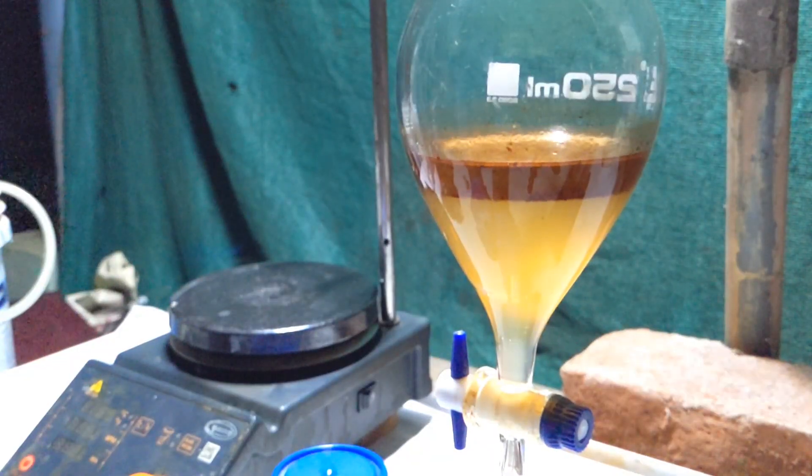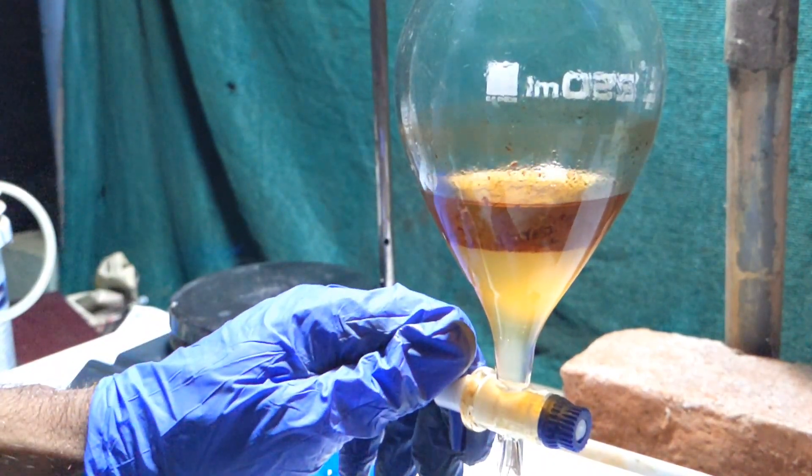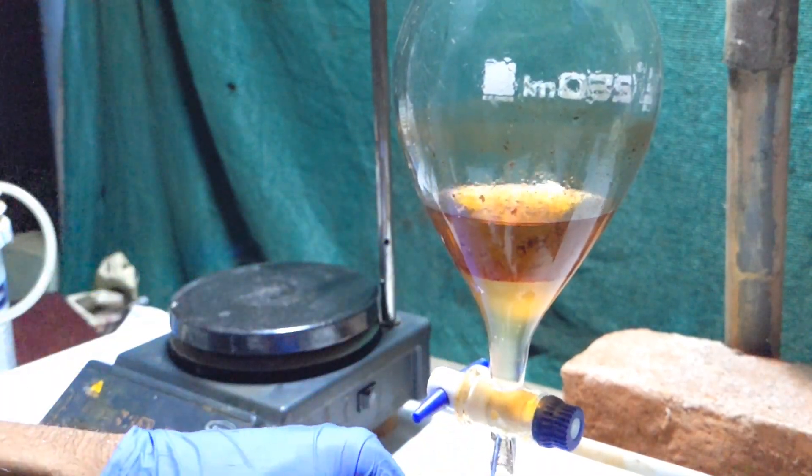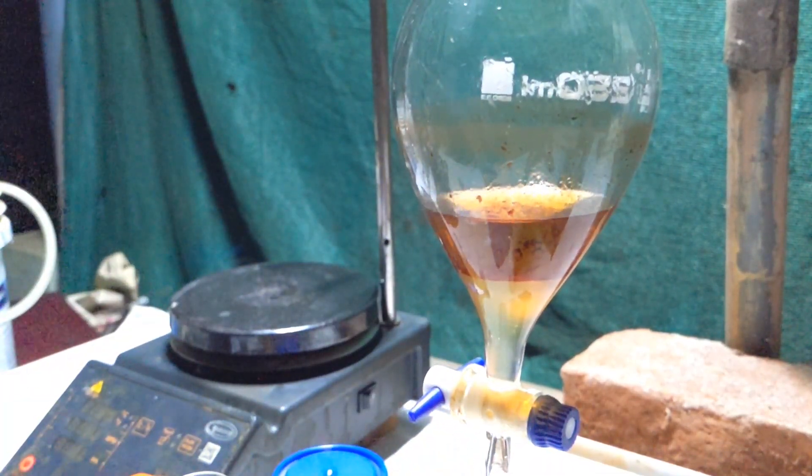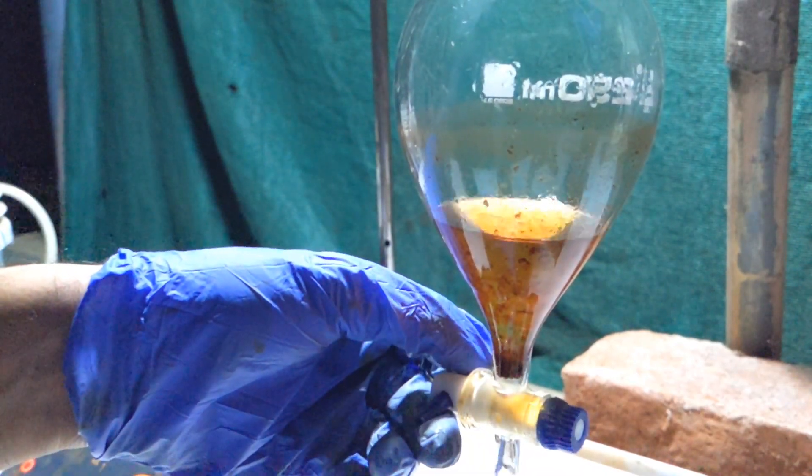Then the funnel was clamped again and the layers were allowed to separate. The upper layer is the ether layer and the lower layer is the aqueous layer. The ethereal layer will contain the benzyl alcohol and the aqueous layer has the potassium benzoate.